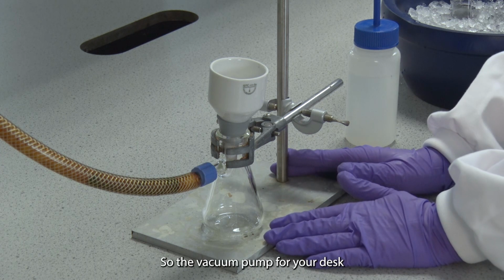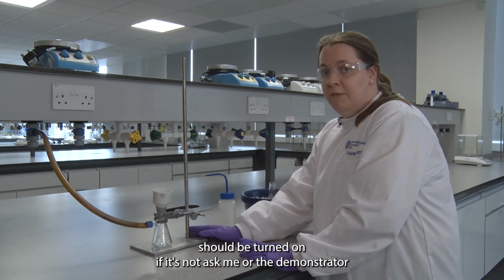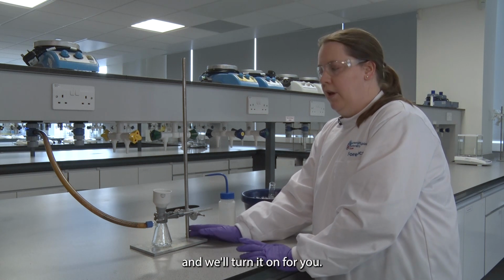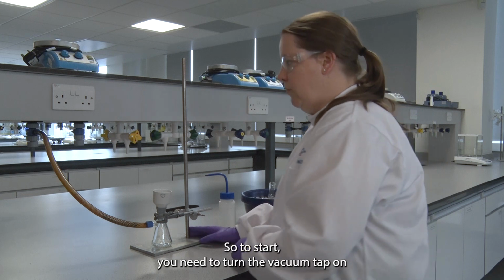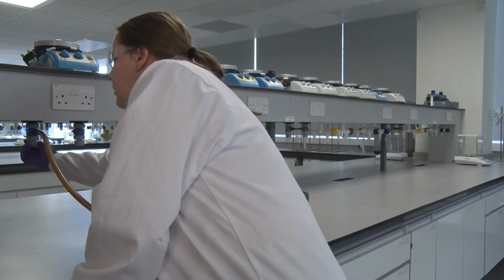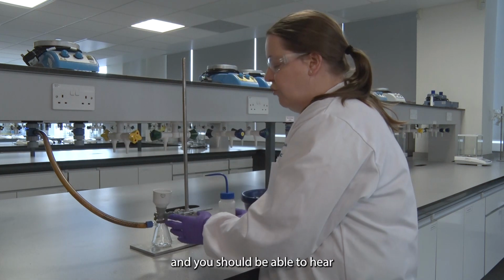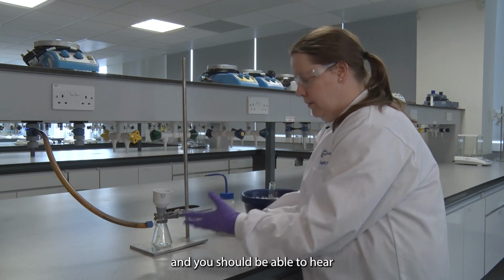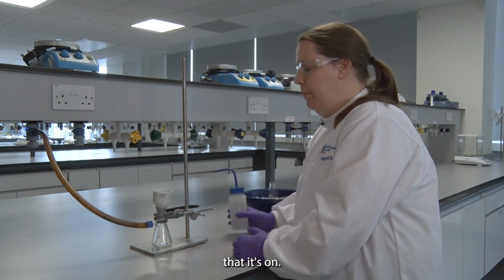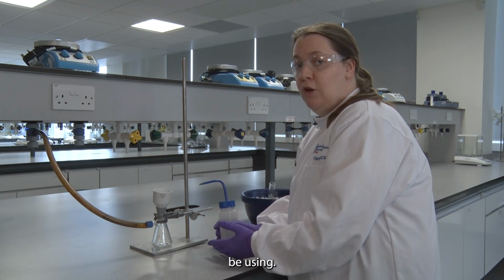So the vacuum pump for your desk should be turned on. If it's not, ask me or the demonstrator and we'll turn it on for you. To start, you need to turn the vacuum tap on, and you should be able to hear that it's on. Then you're going to spray a little bit of the solvent that you're going to be using.